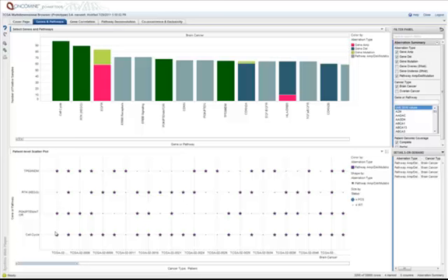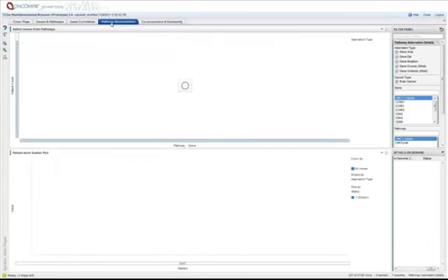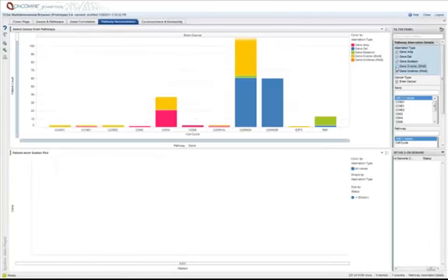Now let's drill into some of these pathways, and we'll begin with the cell cycle pathway. Our question here is, what are the components of the cell cycle pathway that are most frequently altered in glioblastoma, and how do those components relate to one another, i.e. do they occur together or in a mutually exclusive fashion? What we're going to do is go to the pathway deconvolution tab. I'm going to turn off the expression calls and focus specifically on amplifications, deletions, and mutations.